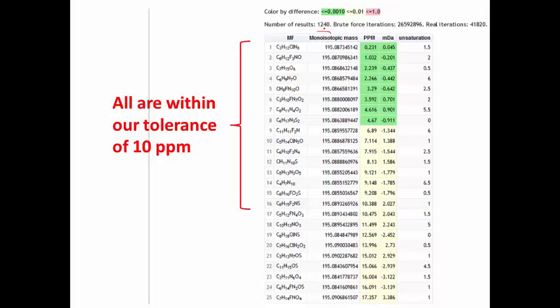But we know that we're better than that. We know that the mass is actually within 10 parts per million of the mass that we've observed. So that means these are already ranked according to how close they are from the calculated formula. So everything above 10 parts per million we can immediately eliminate, which is great. Go from 1,240 down to 15. But 15 is still a rather long list. How do we know which one of these things there is?